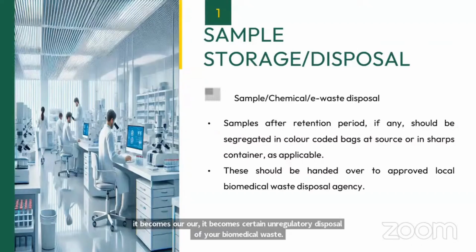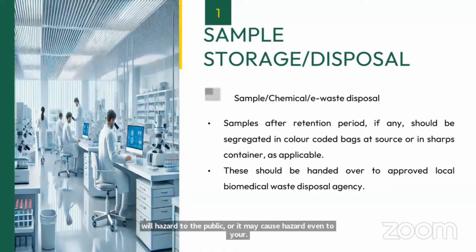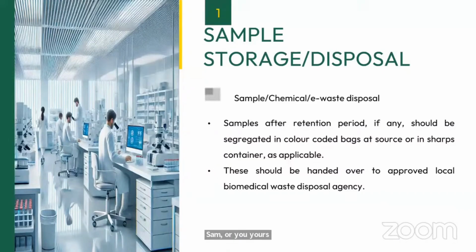So for this purpose, and it doesn't cost much, you should have an appropriate biomedical waste disposal agreement with the authorized agency only. Do not try this type of small cost-saving approaches, because ultimately it will be a hazard to the public, or it may cause hazard even to your staff or yourself in your laboratory. So have a proper biomedical waste disposal agreement.